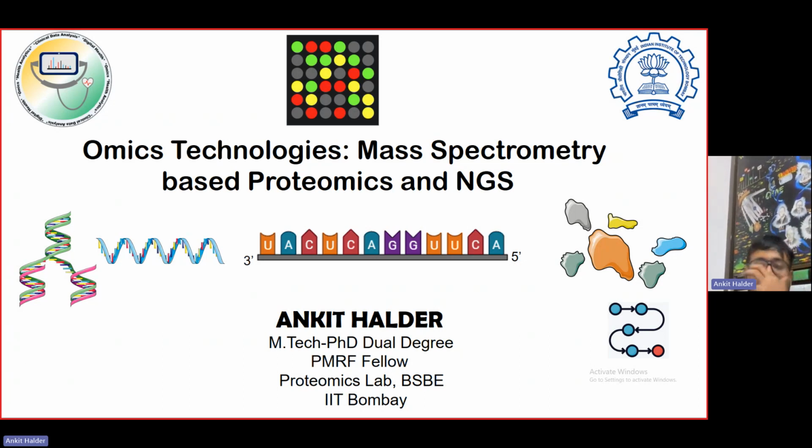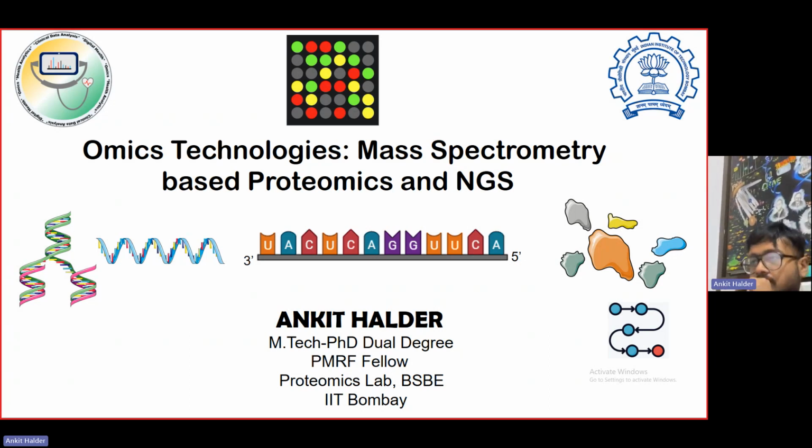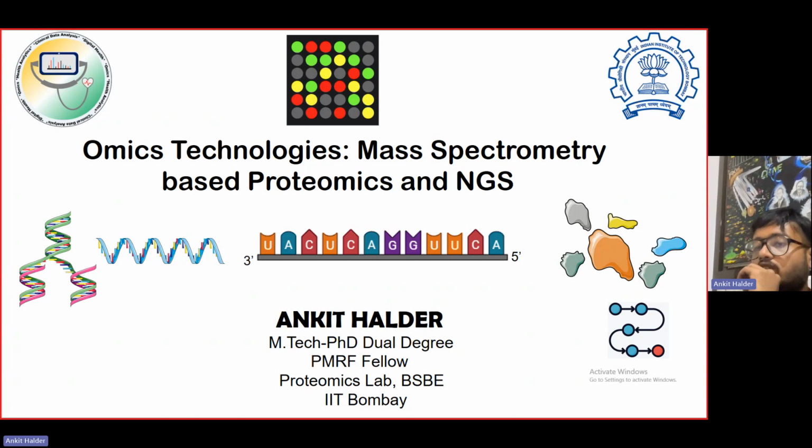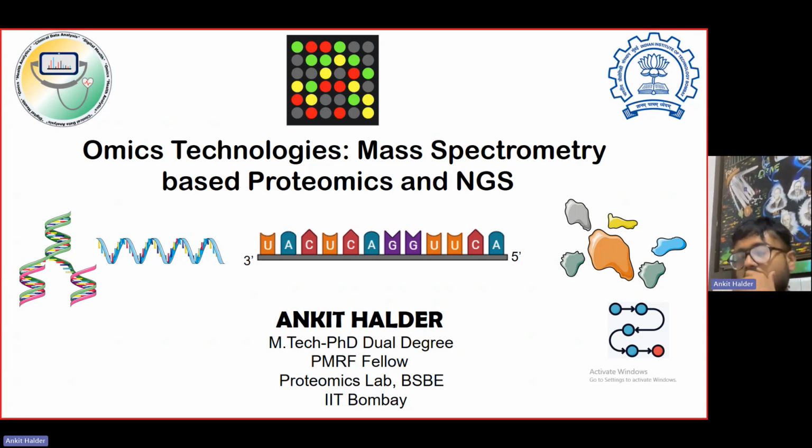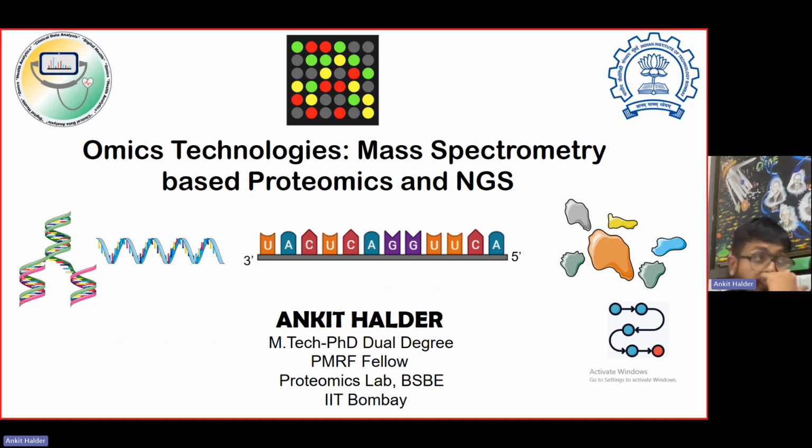So today we would be looking at different concepts of the genomics technologies, along with the things for interactomics which you had gone through, and some mass spectrometry based techniques for IP, immunoprecipitation, and other things.